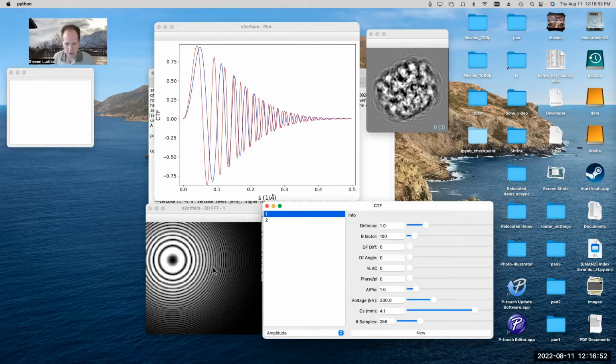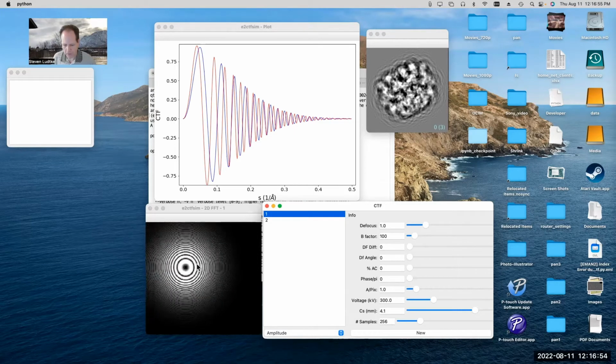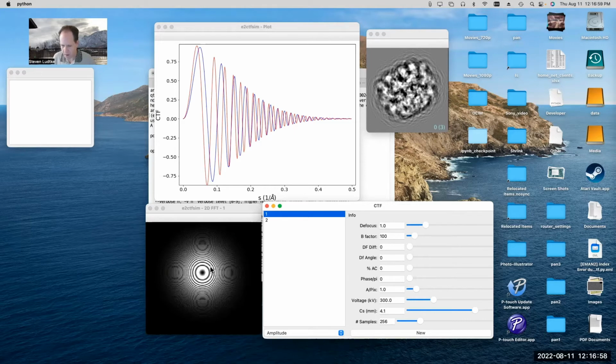There was actually a long time when Marin van Heel was strongly suggesting, and may still be strongly suggesting, that you do your phase flipping CTF correction on the whole micrograph rather than on each particle, because if you do it on the whole micrograph, then you don't have to worry about any of these effects. I mean, you can go out to 6 microns defocus, and you still won't have any problems with that sort of issue.